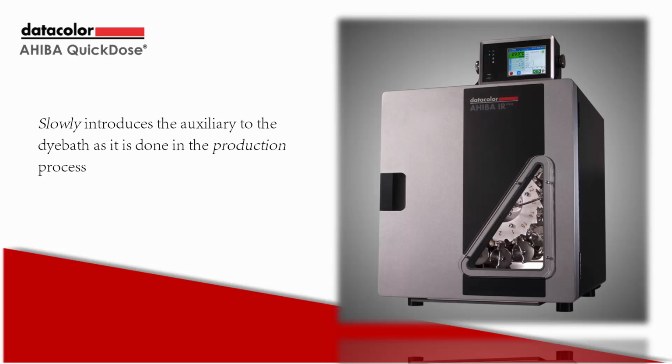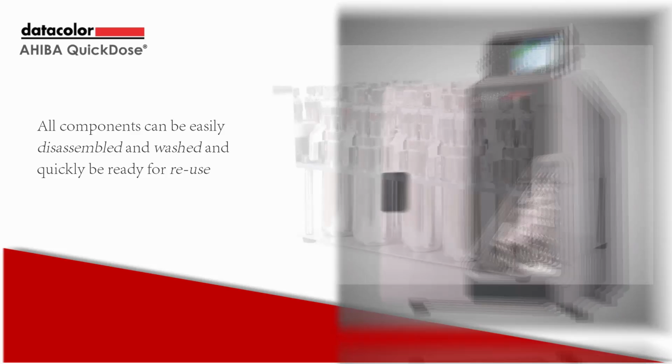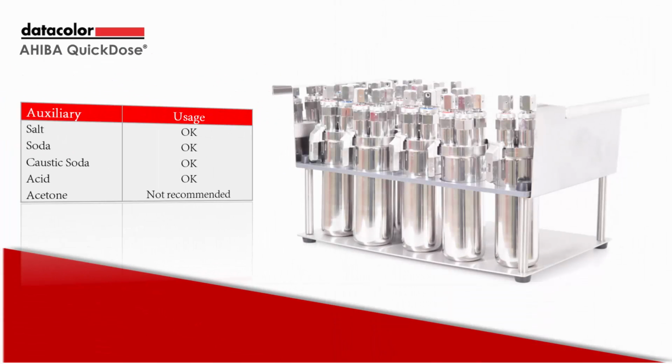After the dyeing process is complete, all components can be easily disassembled and washed thoroughly and quickly be ready for reuse. The following table shows the chemicals tested by Datacolor. Other chemicals might be used, however. A check for reaction to stainless steel and silicone should be evaluated first.